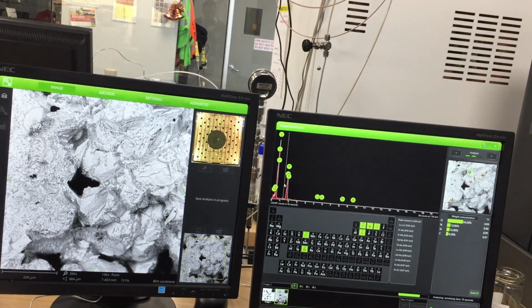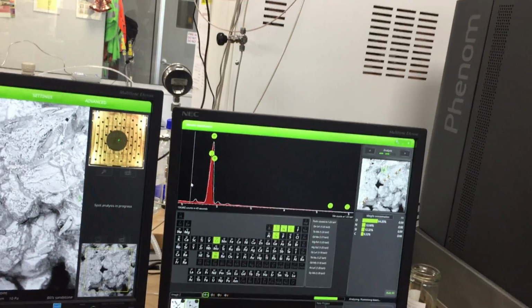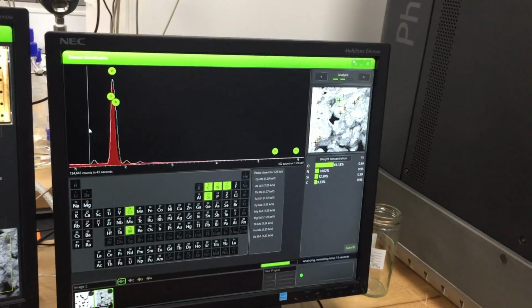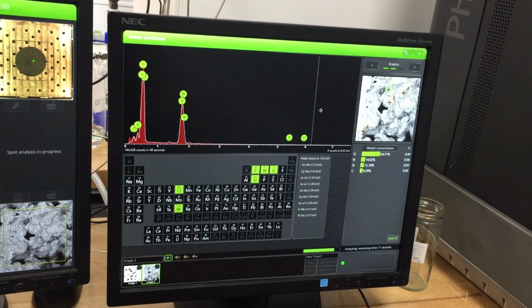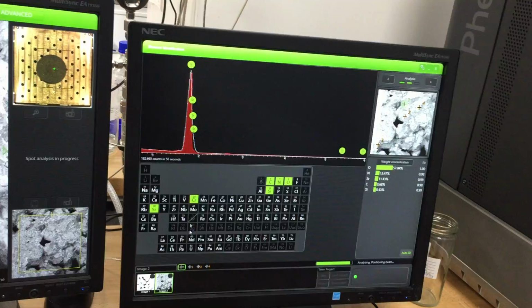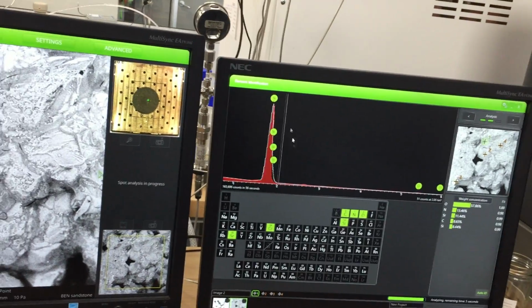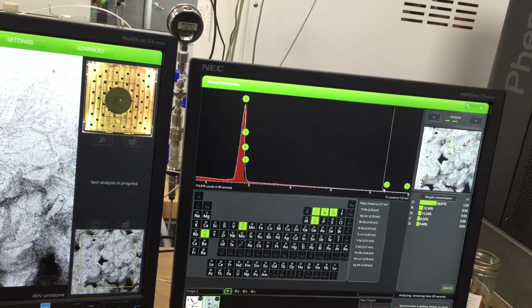So you bring the cursor. Can you record that? Because I had a problem catching that before. Do you have anything in there that has tungsten in it? Tungsten. I don't think so. No tungsten. What's CR? CR or chrome? CR is the chrome. Do you have chromium there? Yeah. Okay. There's a signal.